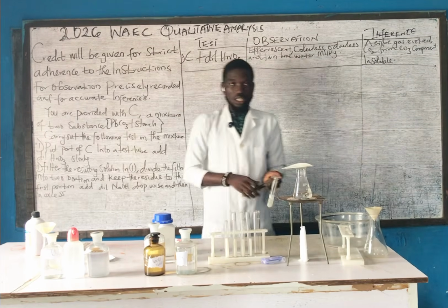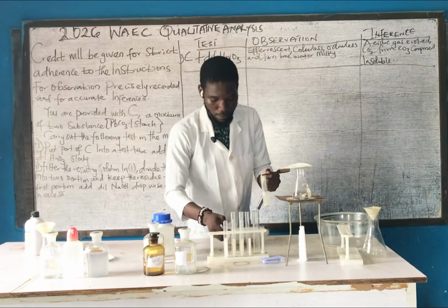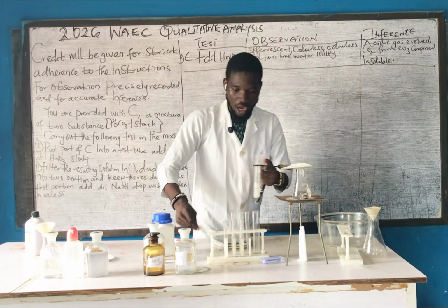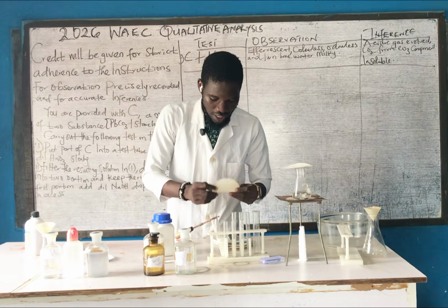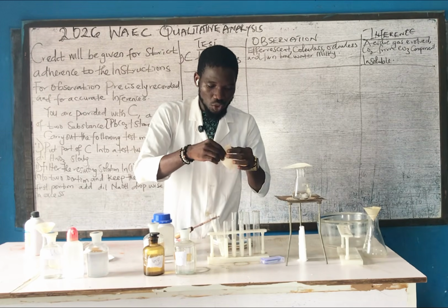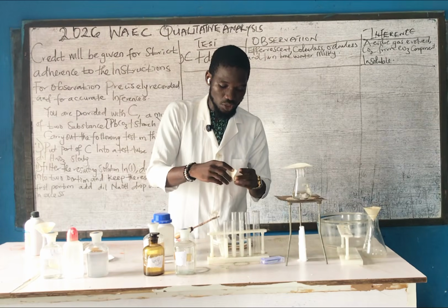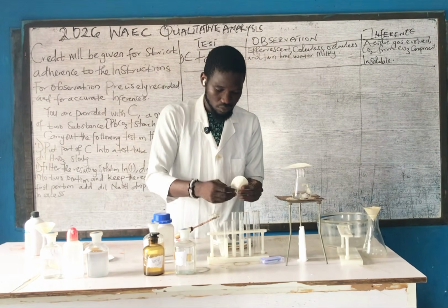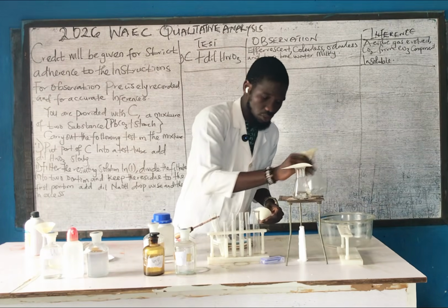So now we are going to have our filter paper. You place this back here. You have a filter paper to separate the filtrate and the residue.